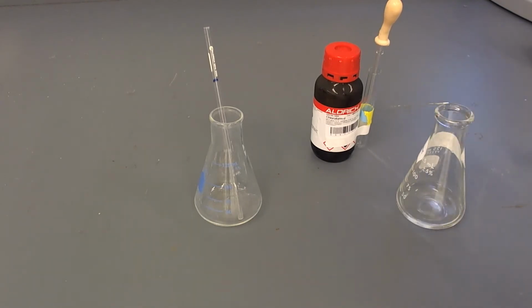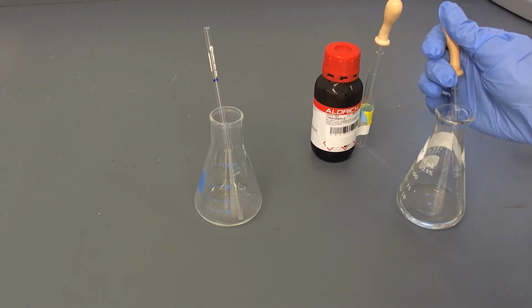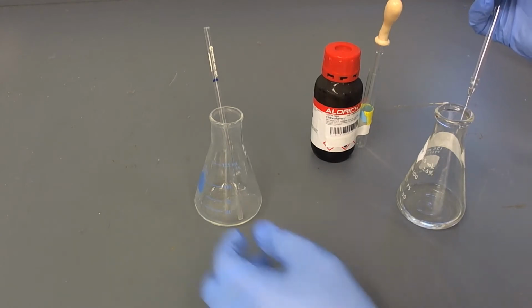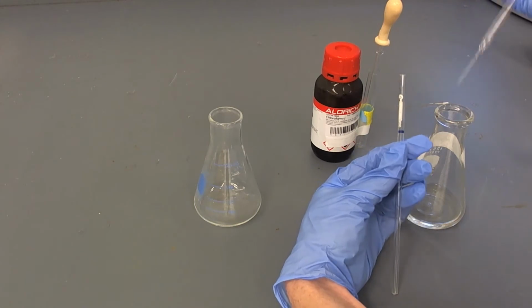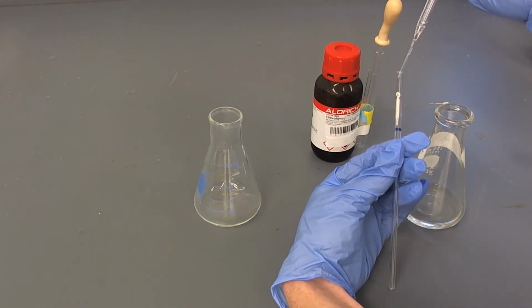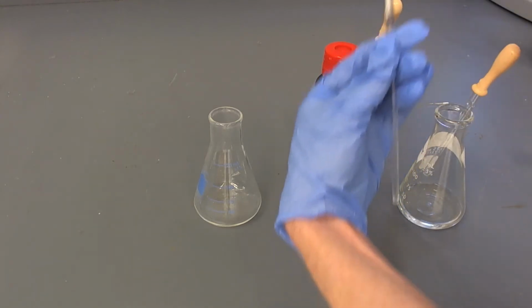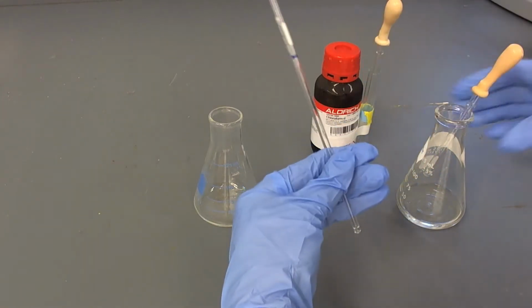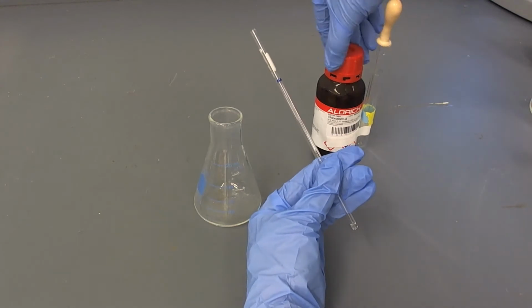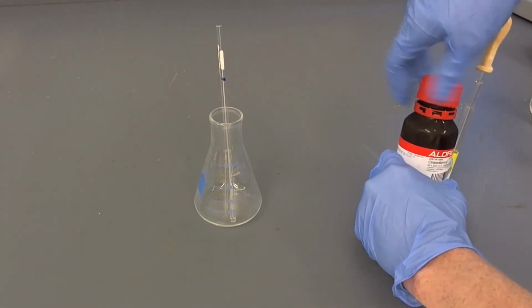You just grab a clean pipette, draw up some of that liquid, and then we're going to put just a couple of drops into the top of that NMR tube. 1, 2, 3. That is enough of the liquid in the bottom of the tube. Now the rest of the liquid in this NMR tube, and we can rest that in the flask, is going to be NMR solvent.